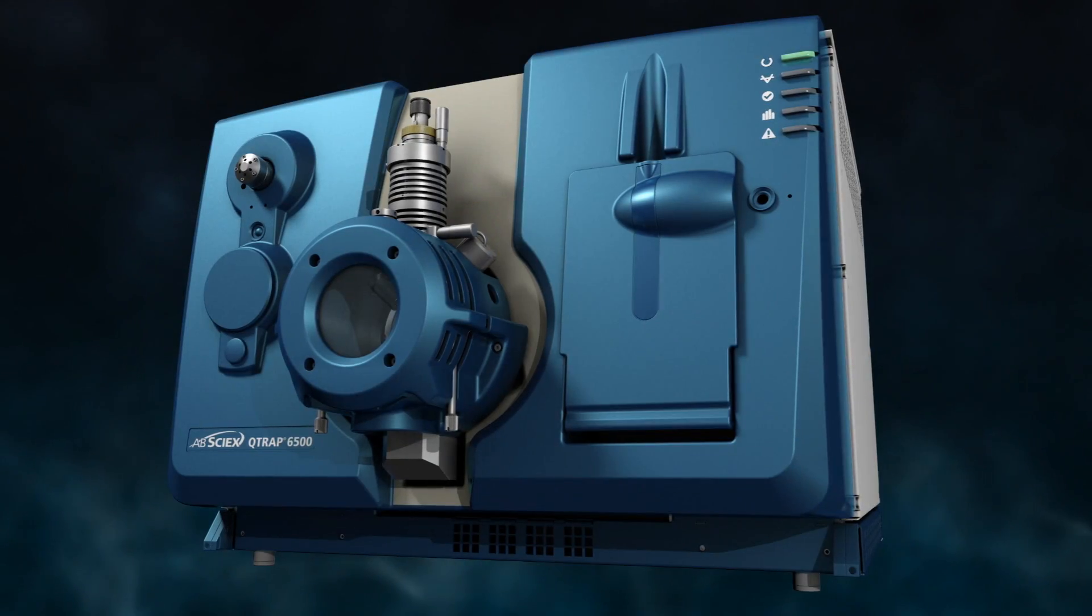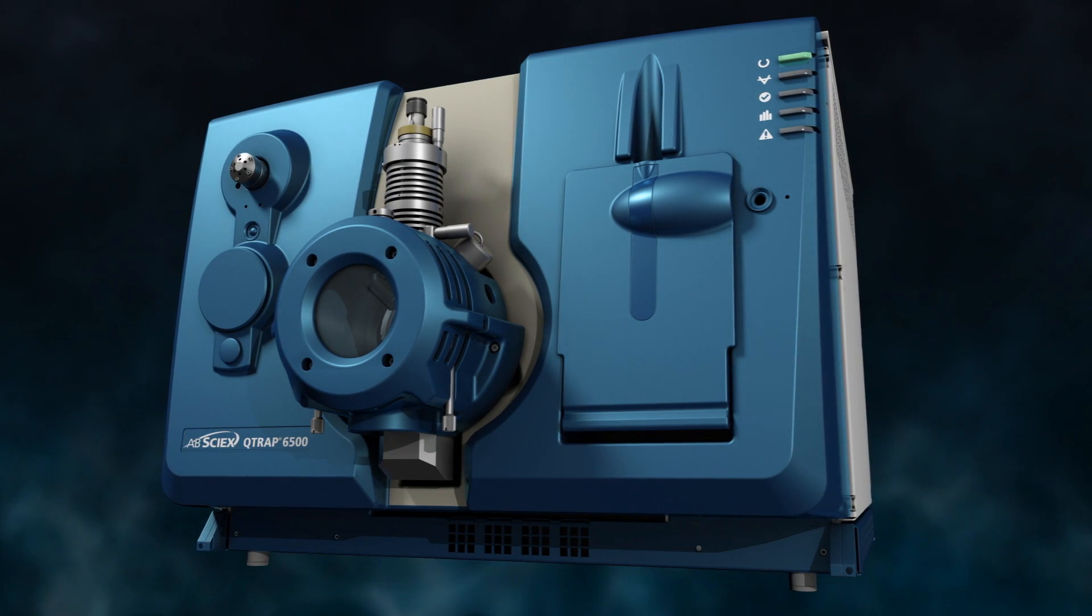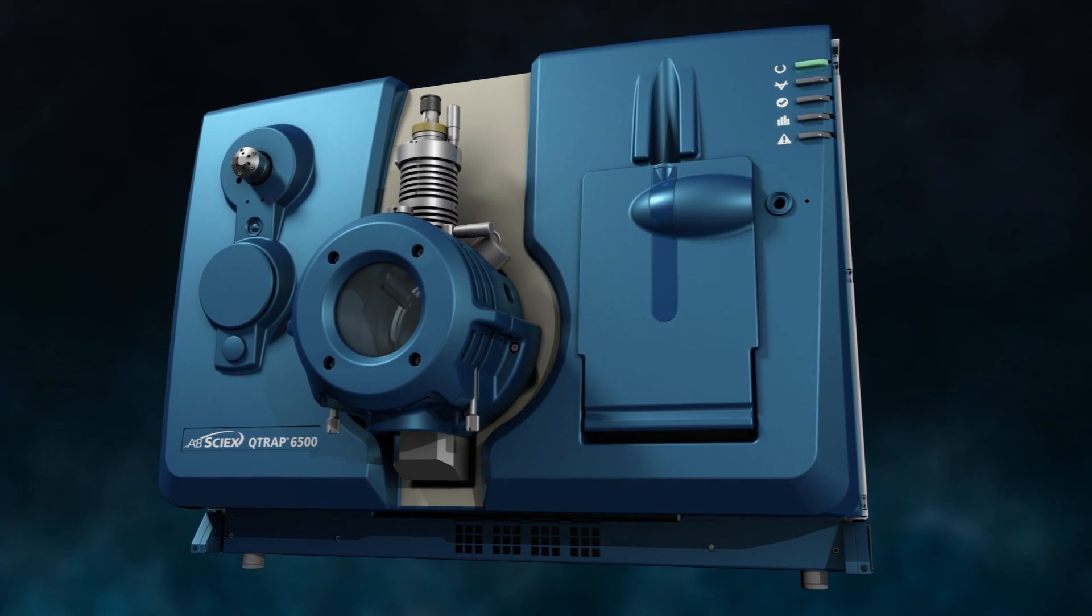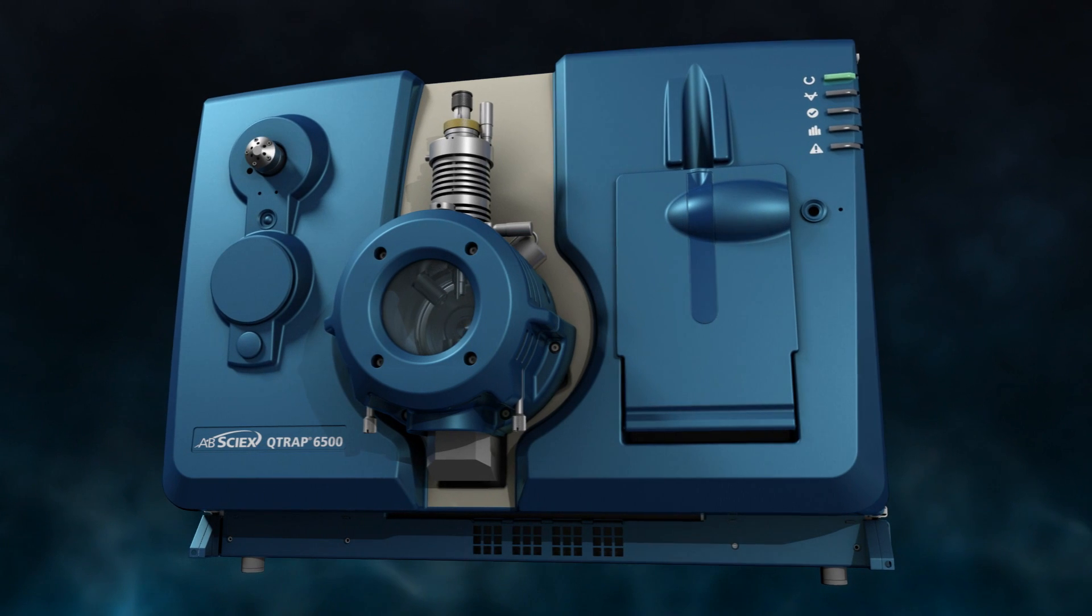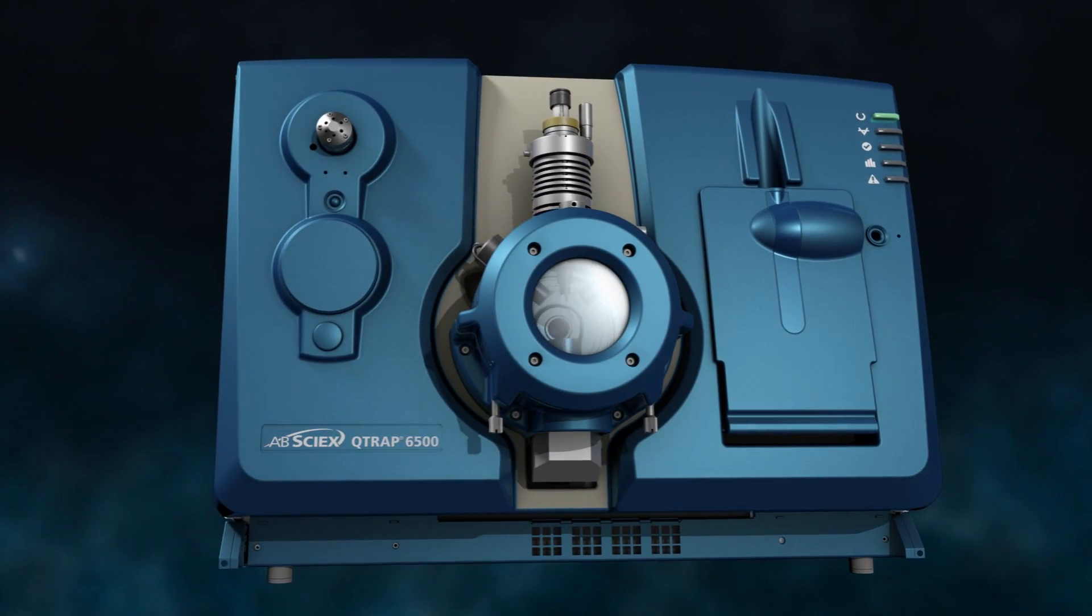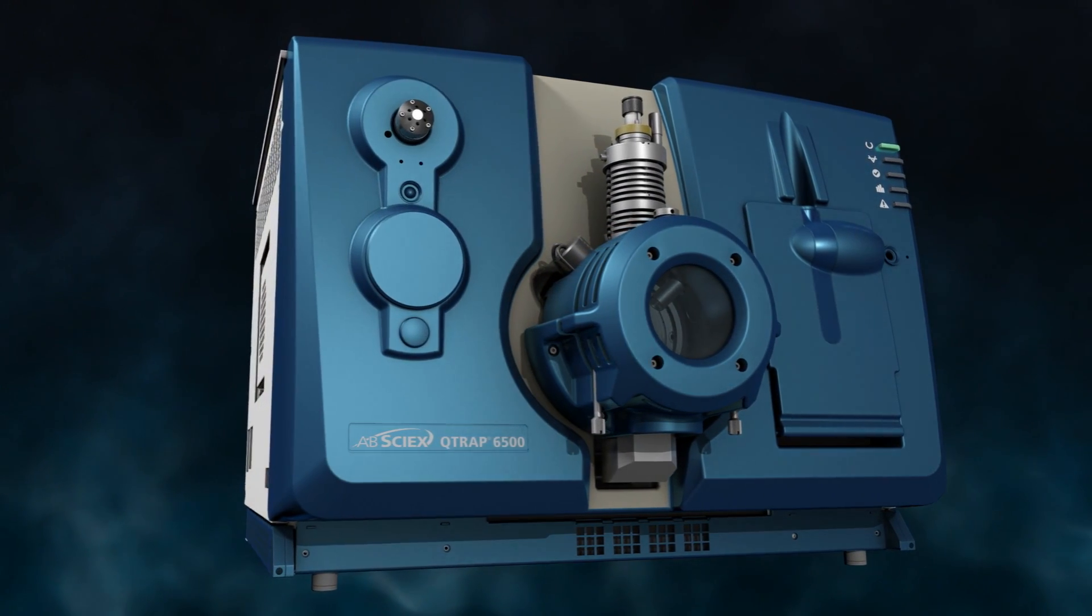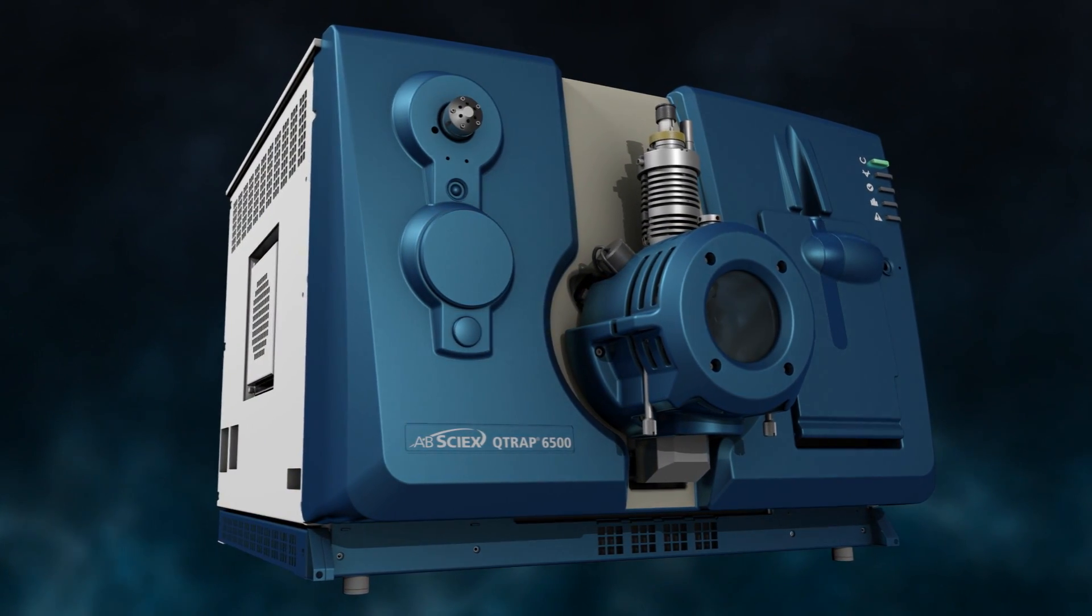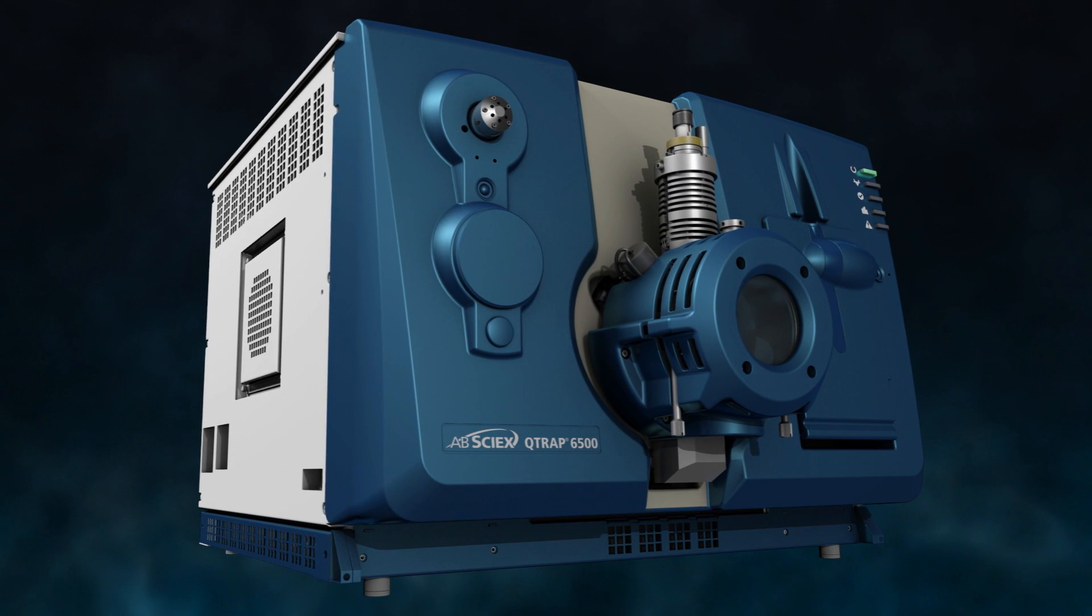The all-new ABSYX 6500 series LC-MS-MS with ion drive technology, exceedingly sensitive, sharply focused, to achieve the lowest limits of quantitation in complex matrices. Nothing has changed, except everything.